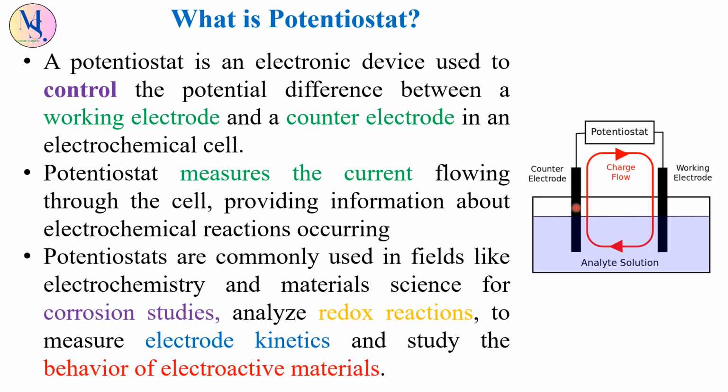So potentiostat may be helpful in various fields of electrochemistry and material science for different studies like corrosion studies, redox reactions, electrode kinetics, and the study of behavior of electroactive materials in an electrochemical cell.